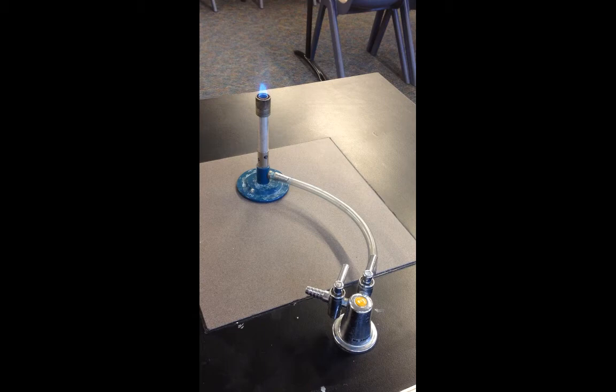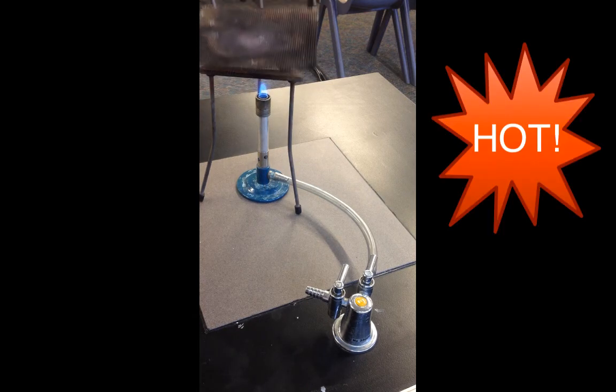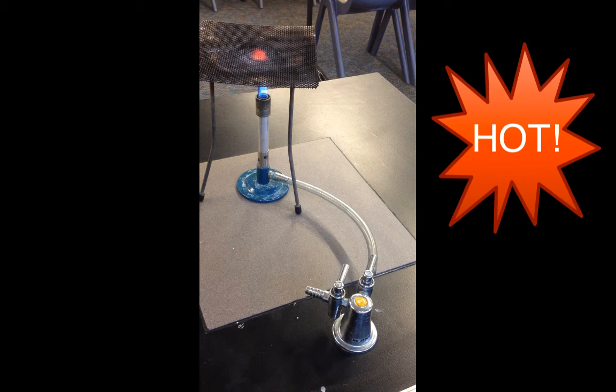When you're going to heat something, you place a tripod over the top with a gauze. Once the gauze is on top of the Bunsen burner, you do not touch it until it has cooled down — you can already see that it is starting to get warm. If you were to have some water in a beaker, you might place that on top to heat up.